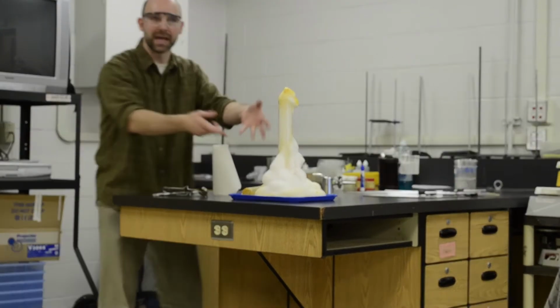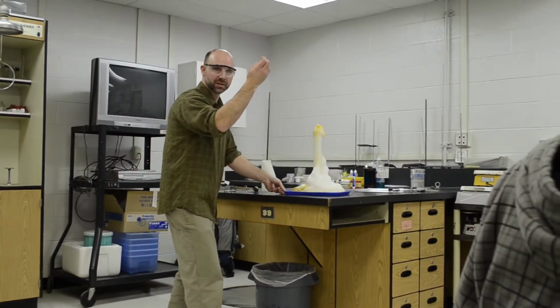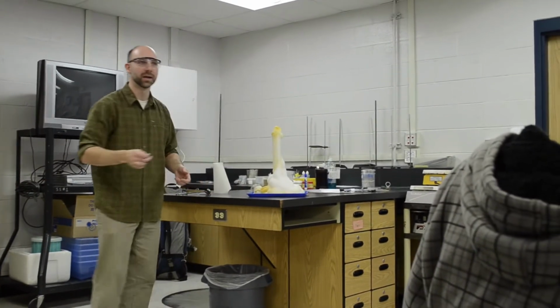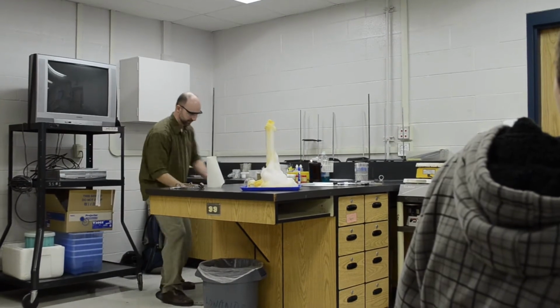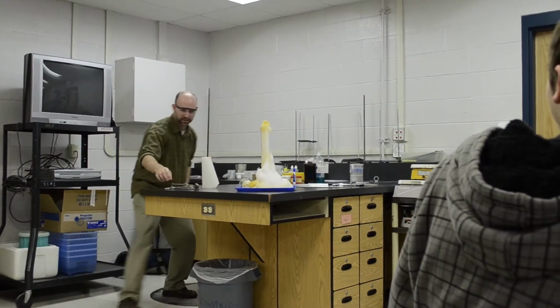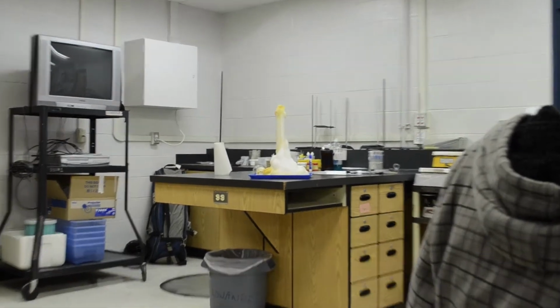Well, there's a lot of oxygen stored up in those bubbles, so I'm thinking since I have more oxygen in there, that'll increase the concentration of the reactants, right? So if this starts burning and I drop it in there, it should react at a faster rate. And this is why chemistry is my favorite class. Okay, all right, here we go.